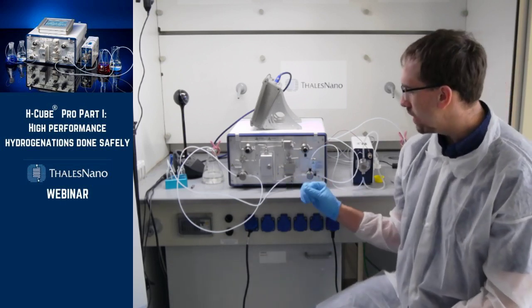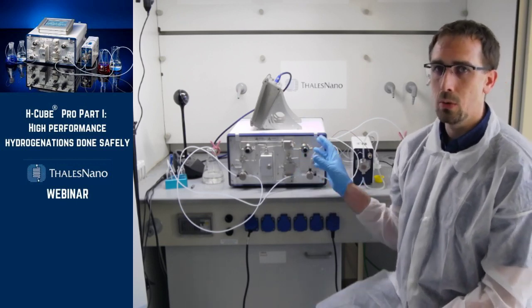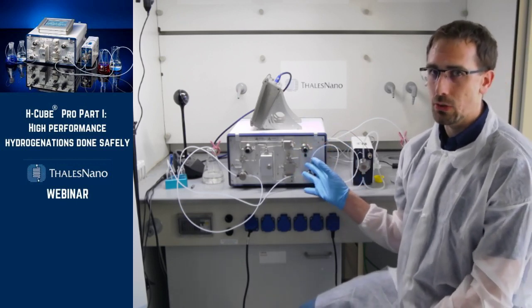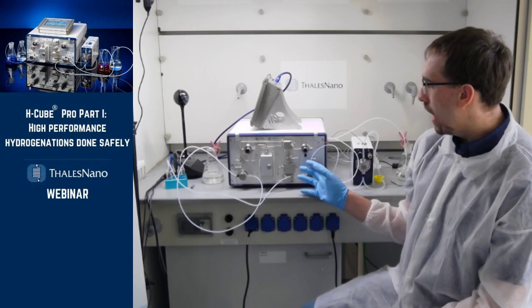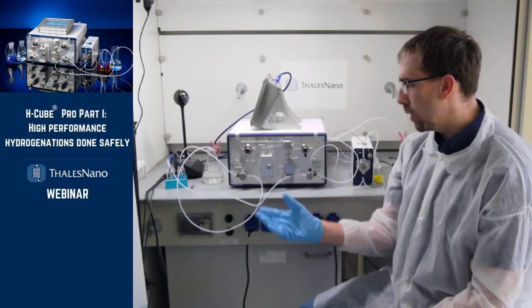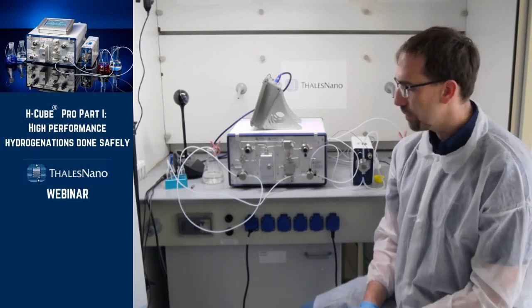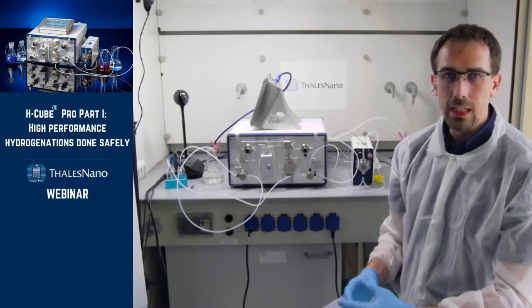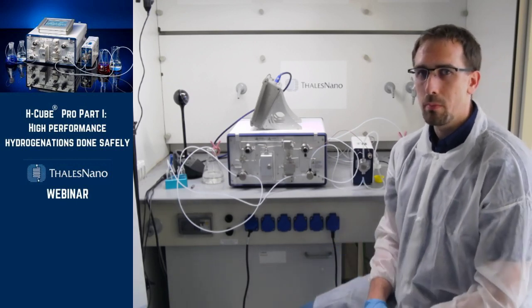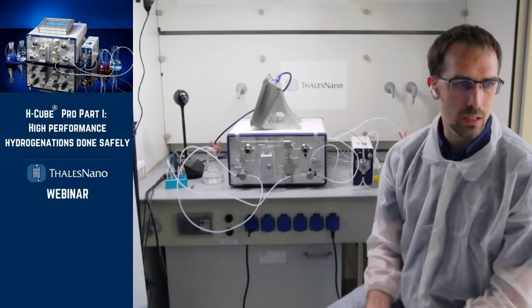One more comment about this. So the H-Cube Pro is really dedicated to easy and quick hydrogenations. In principle, to perform a hydrogenation with the H-Cube Pro takes you, in most cases, less than an hour. With the Phoenix, you would need much more preparation, except if you dedicate your instrument for hydrogenations.